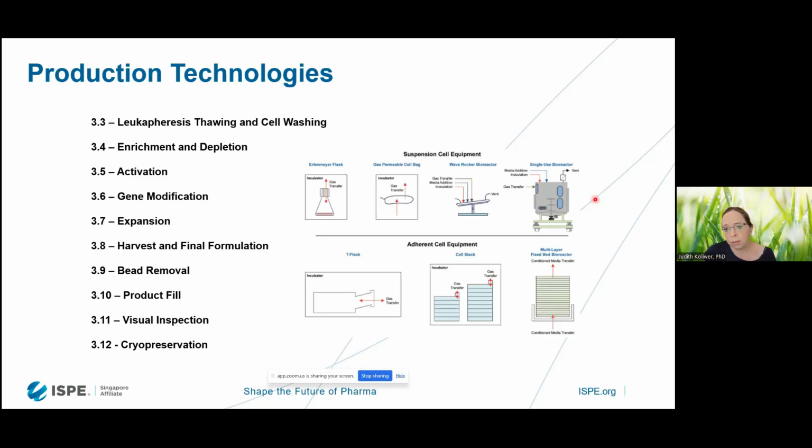At the same time, this can't necessarily really replace the cell count if we have filed our approval with a cell count process. So that's another consideration that we really suggest, particularly when it comes to the development of new processes. And that's definitely not news to anyone, but we have also included a little bit of a discussion as to, let's select first really what we want to use also for scale up.